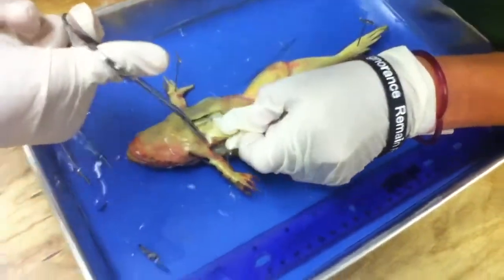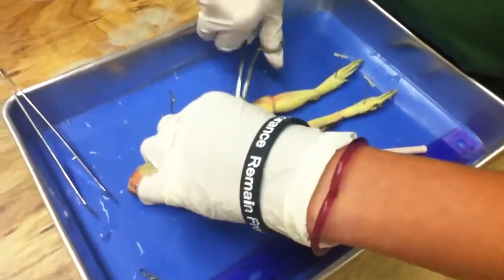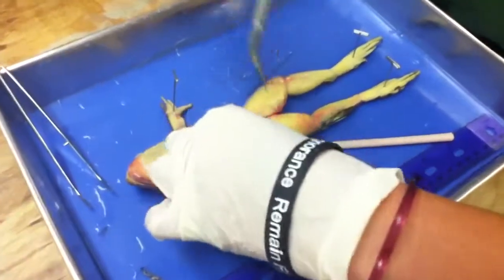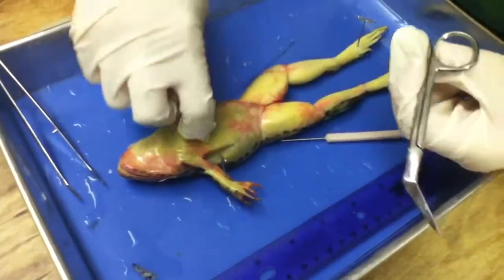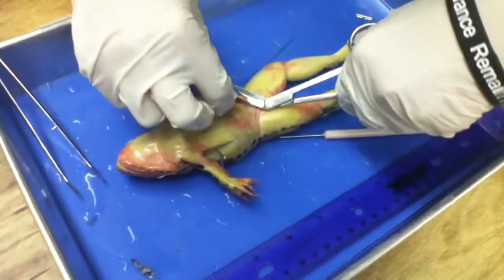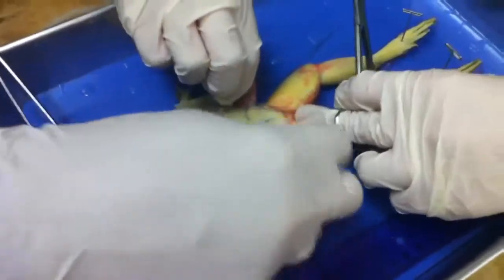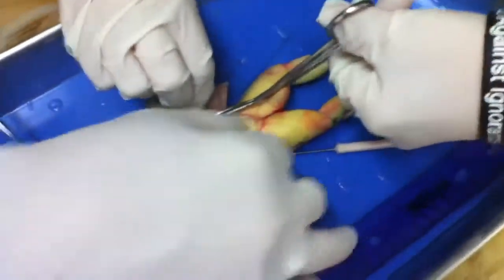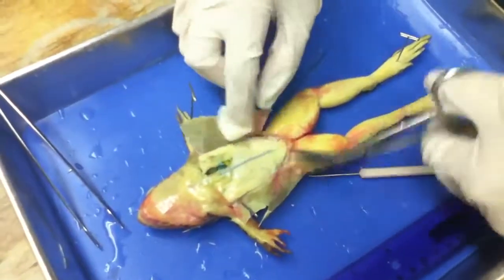Okay. And then what's going to happen? Doing a good job. What'll happen is the abdominal cavity is, you see this, and then you're going to do the same thing. You'll cut this up and cut it the same way and spread it out, and pin it all down at the same time.